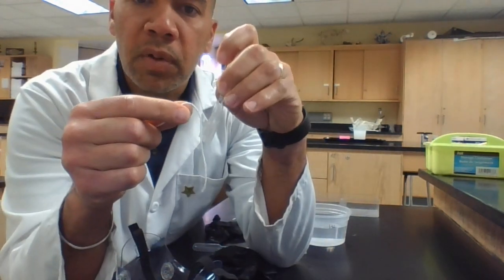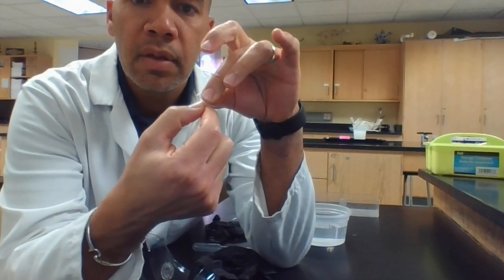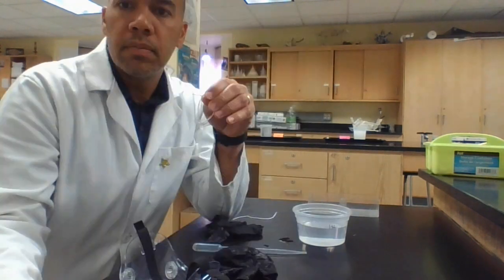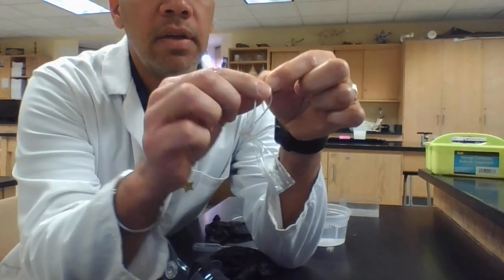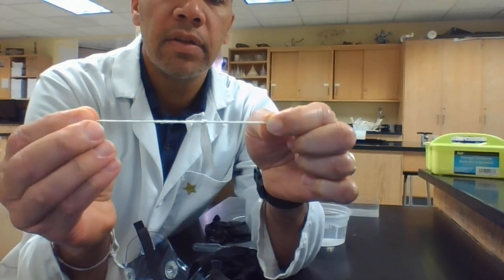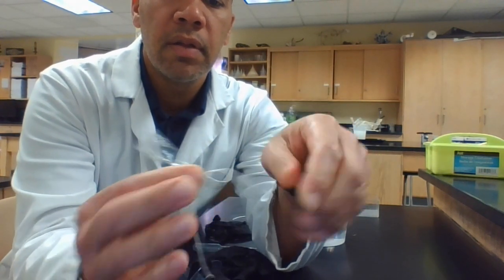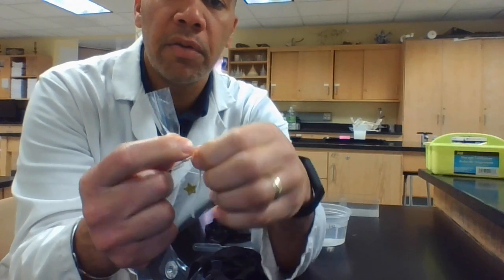Do a double knot, kind of like you would do when you're tying your shoes. Do a double knot on that end. Okay, so as you see, I have one knot so far. I'm going to do another knot. Okay, and so now this end should be secure. Nothing should be able to leak out of it.